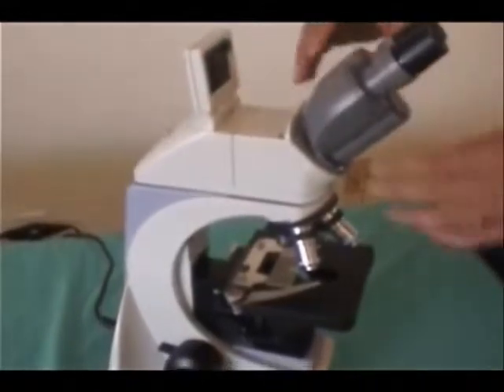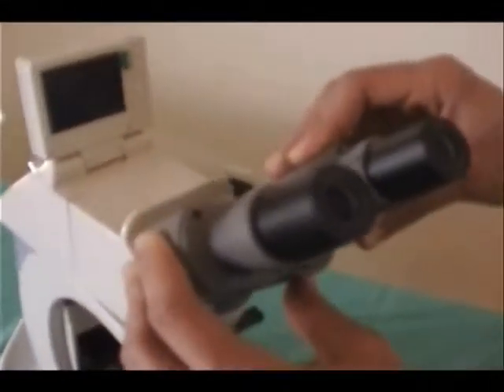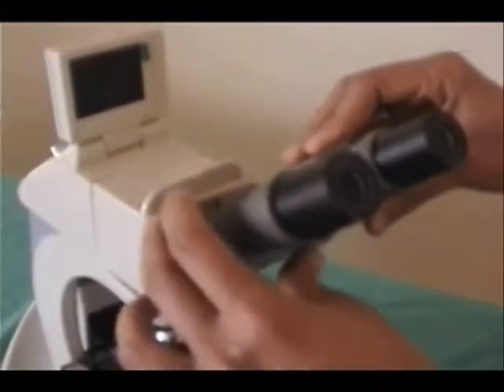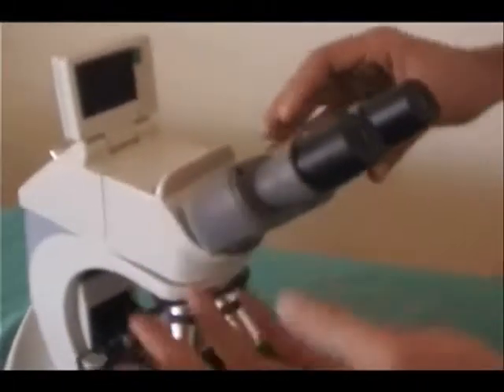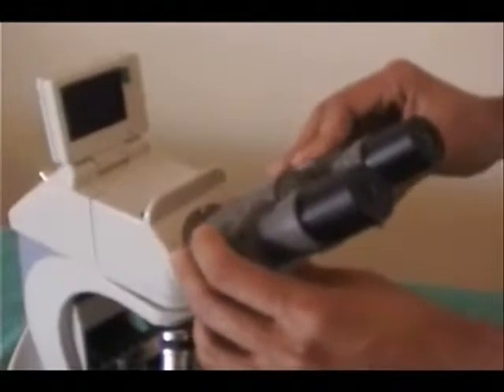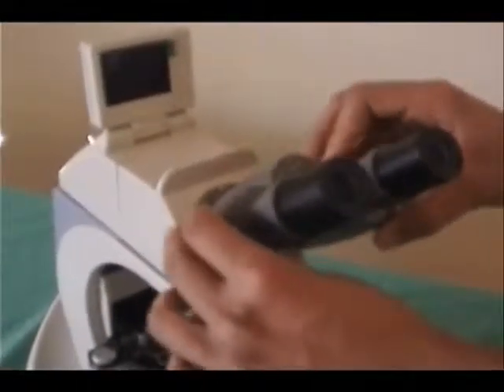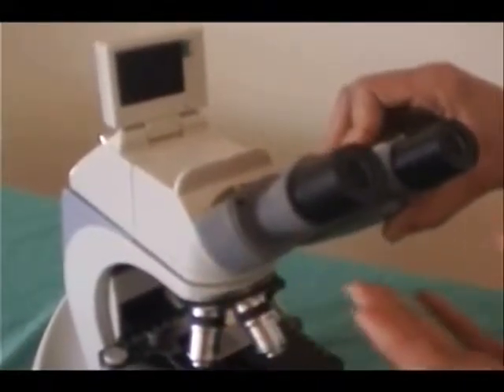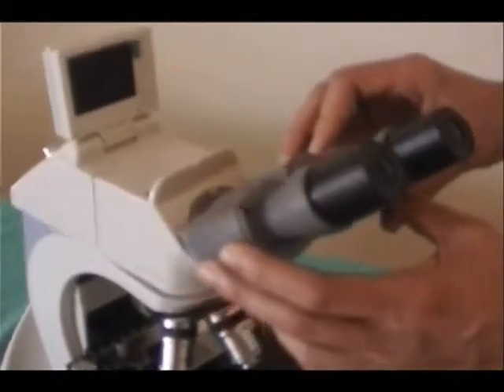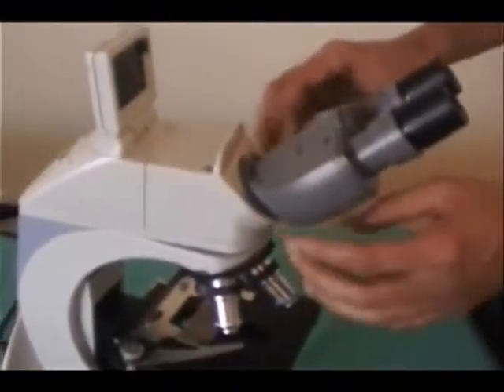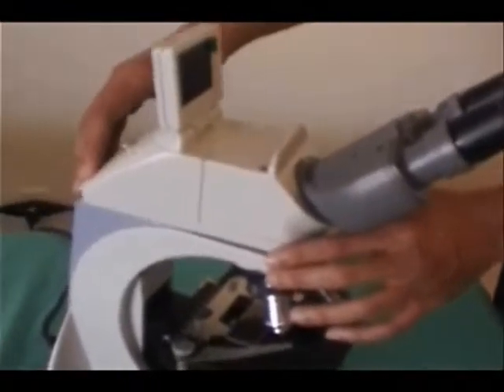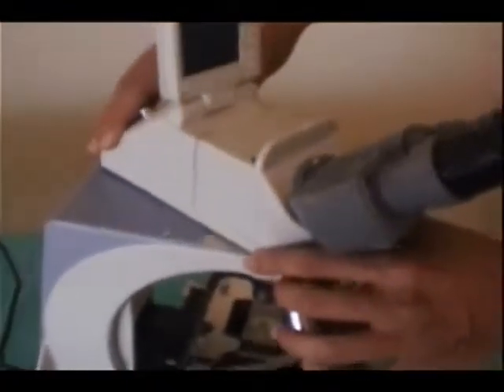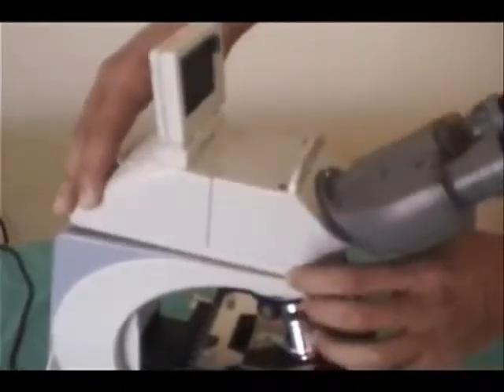First thing we see here is ergonomically designed binoculars. As you can see, it adjusts all the way up to 75 millimeters from 48 millimeters and it swivels up and down so you can get focused to how far apart your eyes are. Also, it's inclined at 30 degrees and the head actually swivels 360 degrees, all the way around if need be.